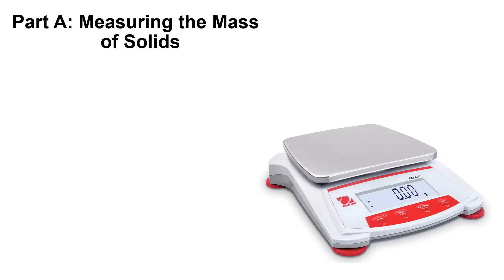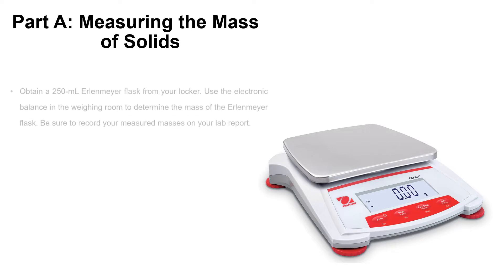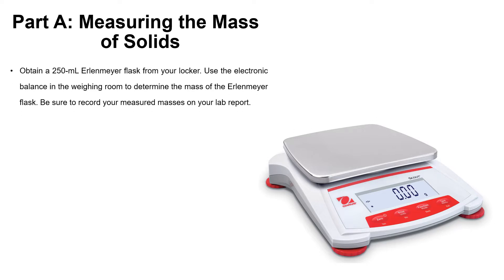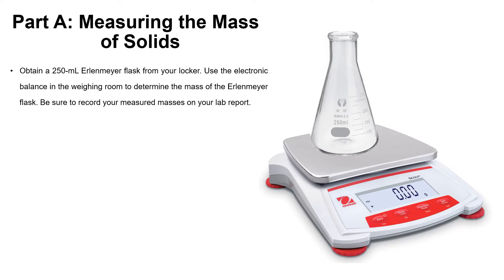Beginning with Part A, we're going to measure the mass of a solid. Obtain a 250 ml Erlenmeyer flask from your locker. Use the electronic balance in the weighing room to determine its mass, then record your measured mass on the lab report. This is what a 250 ml Erlenmeyer flask looks like. You're going to place it on the weighing balance, measure its mass, and record it on the lab report sheet.